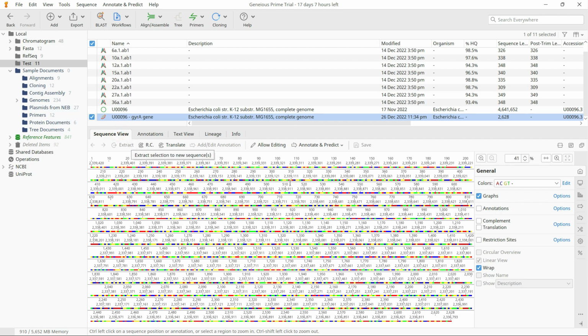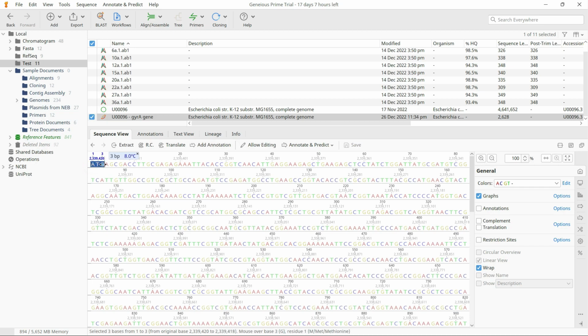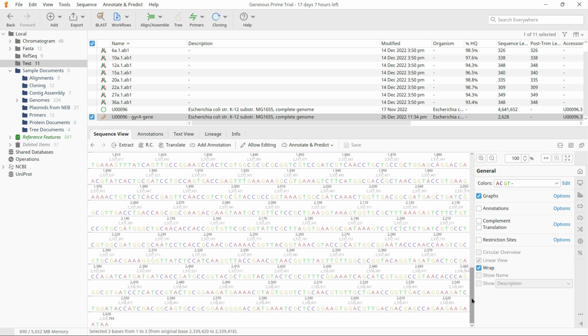Again, look closely at the extracted region. By definition, a functional gene must not have any internal stop codons. As you can see, our extracted region has a start codon at the beginning and only one stop codon, shaded black, at the terminal.